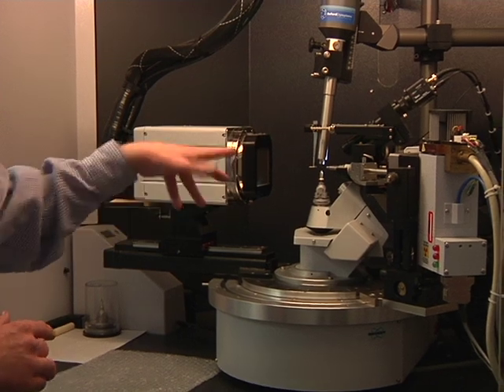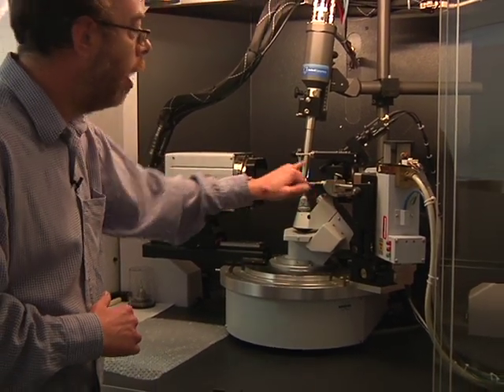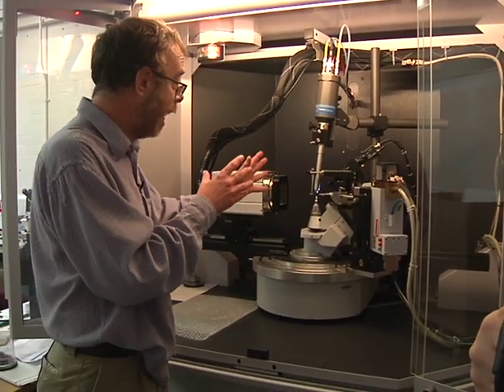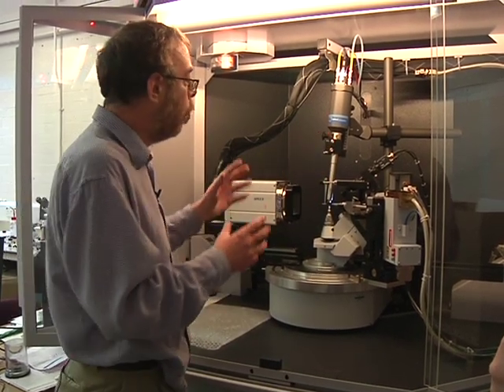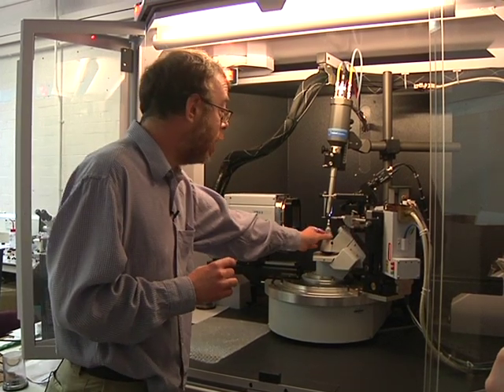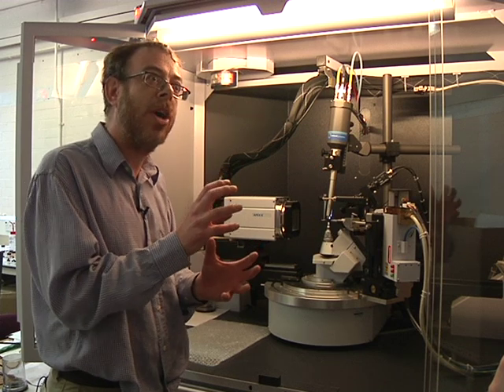There are various bits with this machine that are very important. So, obviously, we have our crystal there. These tubes here, they fire x-rays, and that's very important when we're doing our analysis. Here we have a liquid nitrogen supply, because we don't want our atoms moving about. We want them nice and steady. So we measure this at 150 Kelvin — that's really quite low — to make sure our atoms are just nice and steady.